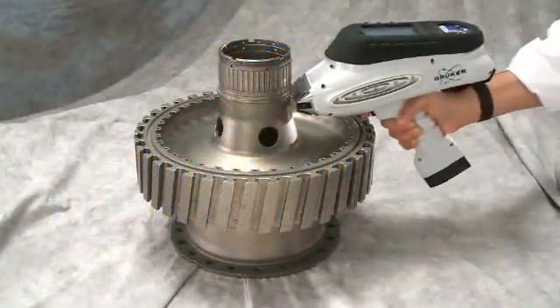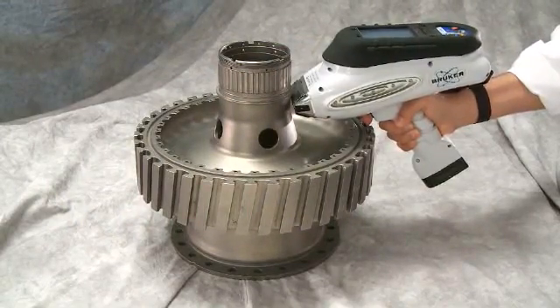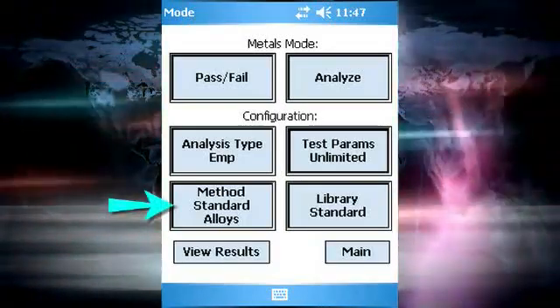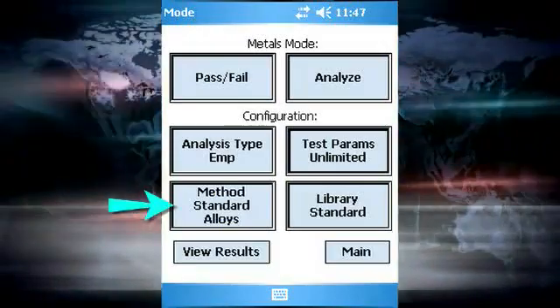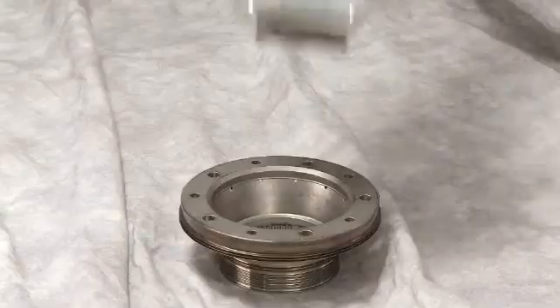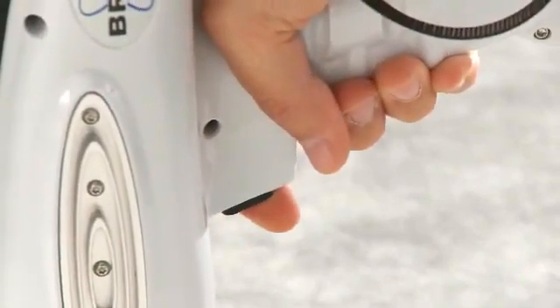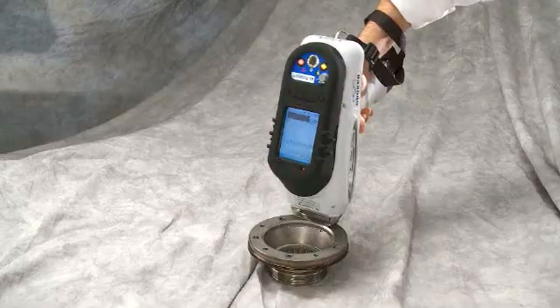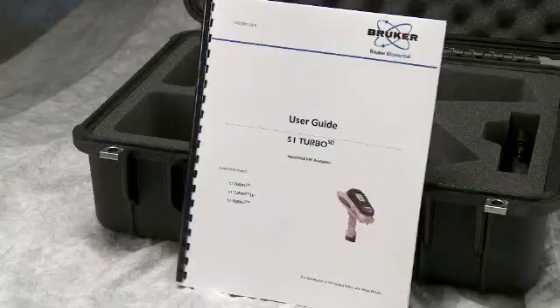The most basic type of measurement on the S1 series analyzer is a single condition empirical calibration measurement. The empirical standard alloys calibration is the most common example of this type of measurement. In this case, the measurement will begin when the trigger is pulled and run as long as the trigger is activated. The S1 software also supports timed assay, in which the trigger does not need to be continuously activated. See the user's guide for details on this capability.